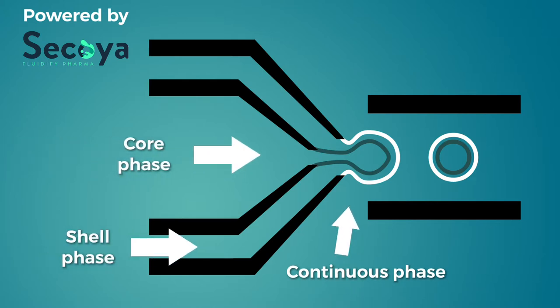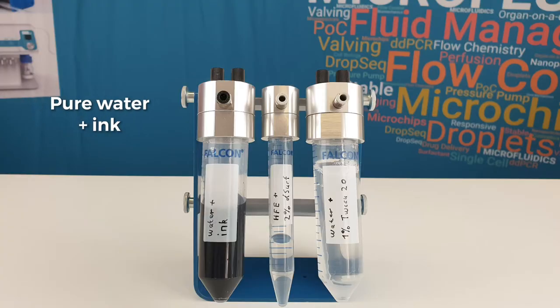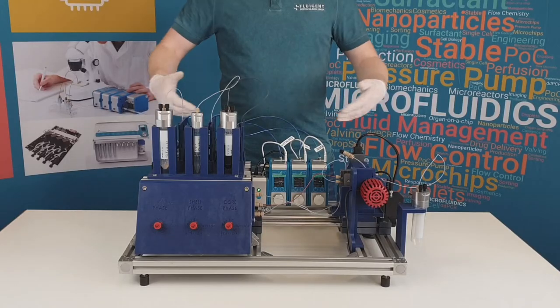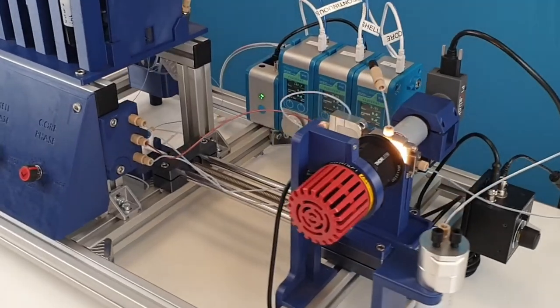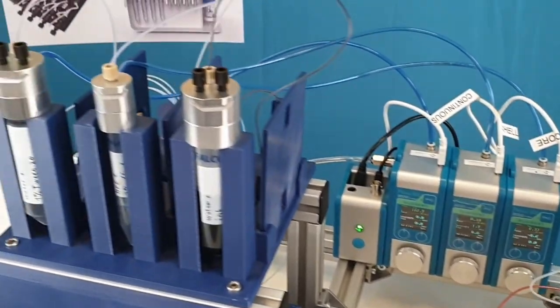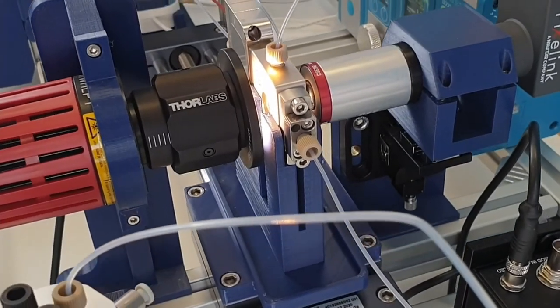The shell phase has to be immiscible with both other phases. In our example we are using pure water with black ink for the core phase, HFE oil with 2% de-serve for the shell phase, and pure water with 1% of Tween 20 for the continuous phase. To make things easier, we use our new platform that holds all components in one place. It helps keep a nice overview, keeps the station vertically to drain the air to the top, and enables continuous monitoring thanks to its horizontal microscope.